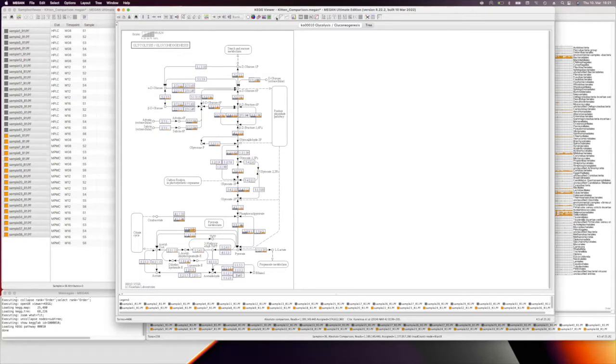You can use a linear scale or maybe a log scale to make the differences more striking. So here it actually looks like there's hardly anything for this enzyme 5424. There's hardly any presence or almost nothing for this enzyme in the gray group. So this can be a really nice starting point to generate hypotheses about the functional potential of your microbial communities.